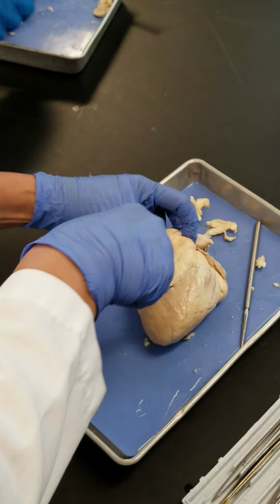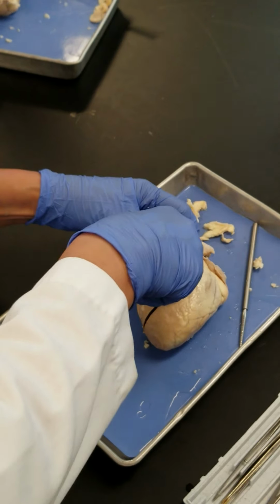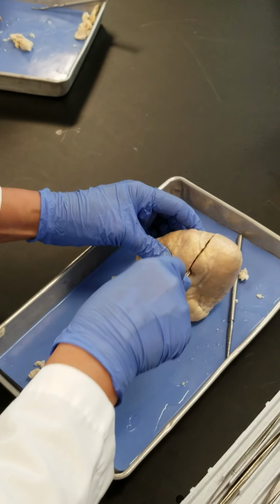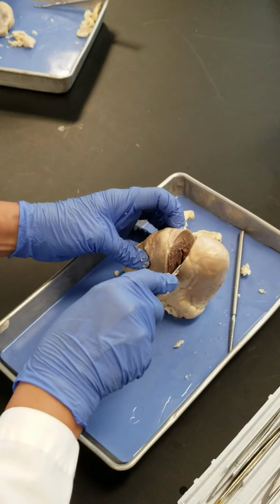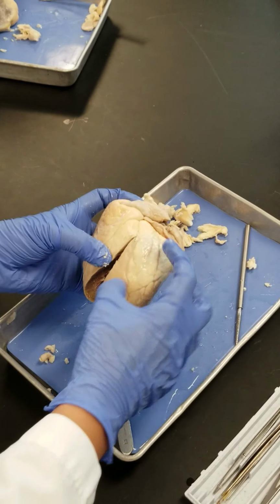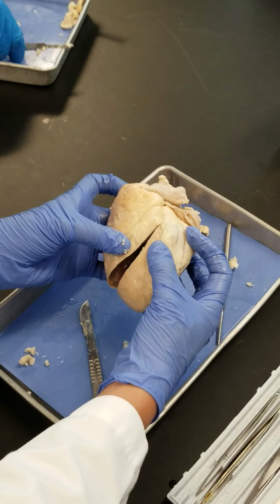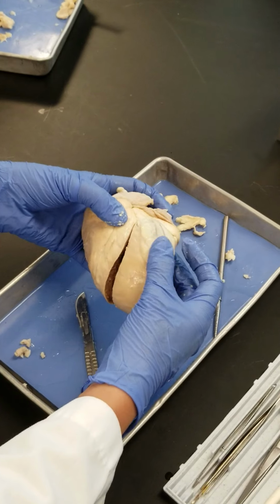Just go deep, and you cut it, going all the way, continuing parallel to the anterior and separating them completely. Now don't go all the way up, right? You want to keep the upper side connected. So you're separating this part of the left ventricle from the rest, where you have the anterior interventricular sulcus.